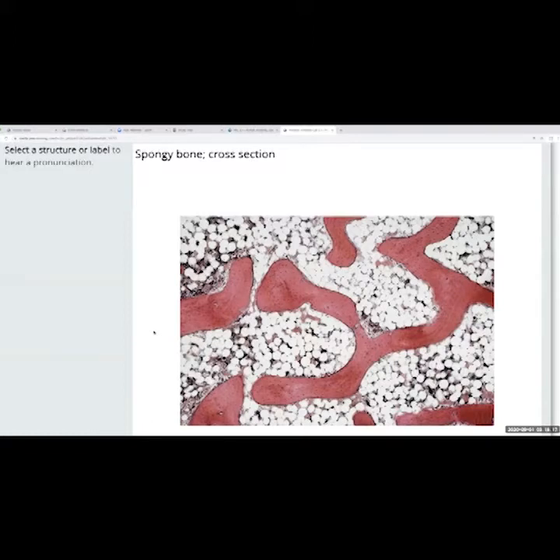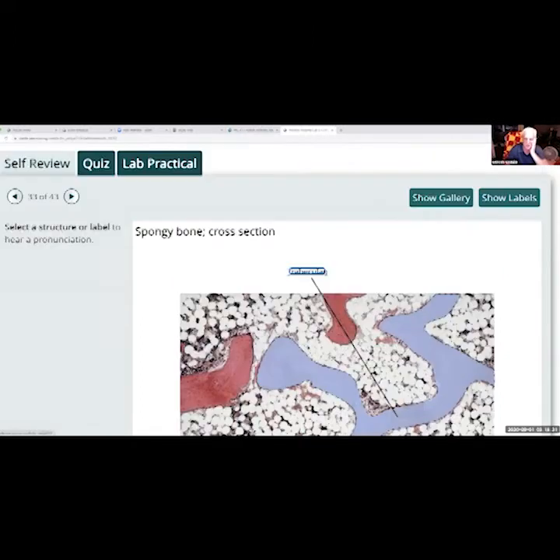What are all these little white cells around it? Fat cells, adipose tissue. Perfect. How can you tell? There's no nucleus. All the nucleus is squished to the side, and it's just white cells. Some can be white or yellow, with this fatty bone where it's yellow.